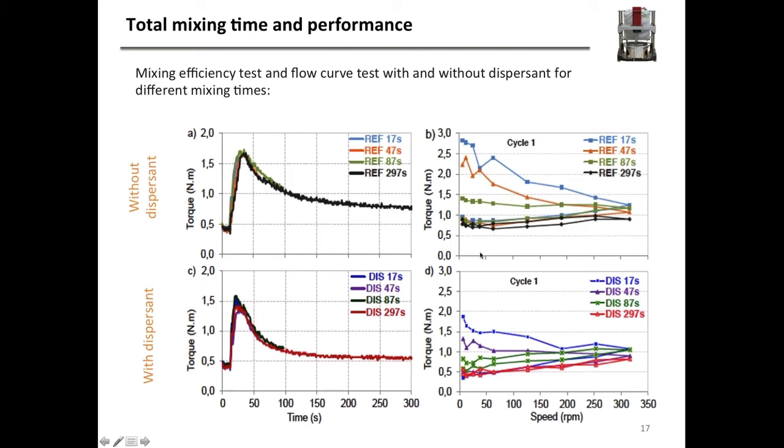All right. With the dispersant, we would see similar conclusions, except that we get better results because the dispersant in and by itself gives you better results. They're globally better. They're all a little closer in the path. There's closer to overlap, and the ones that overlap do so even better. So it confirms again what we've seen.